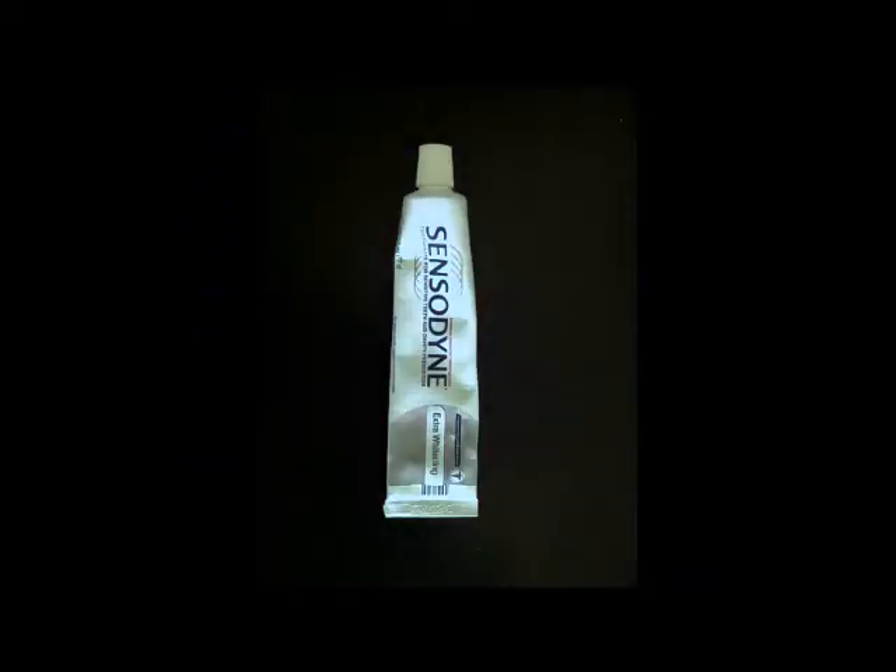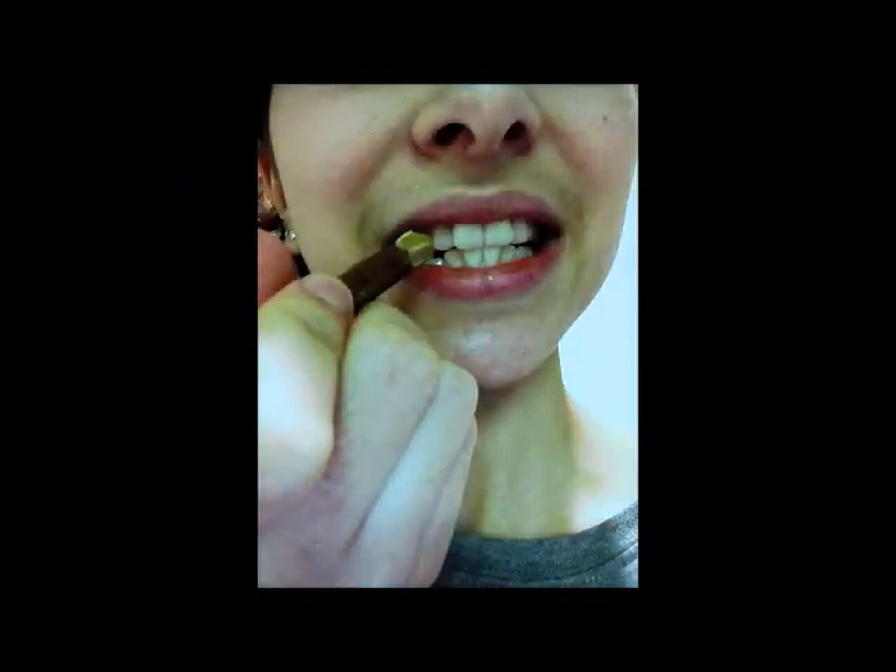Store your petri dish in a cool, dry place. And do the same procedures for Sensodyne and miswak. You can brush your teeth with miswak like this, and it does not require any toothpaste.